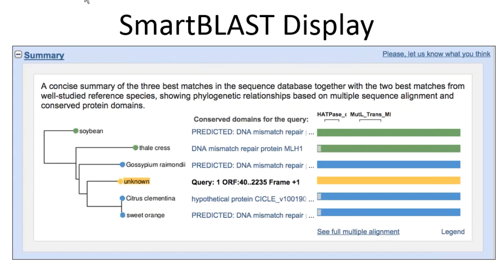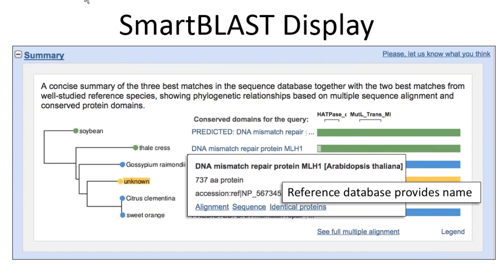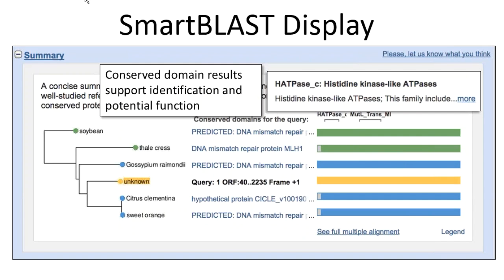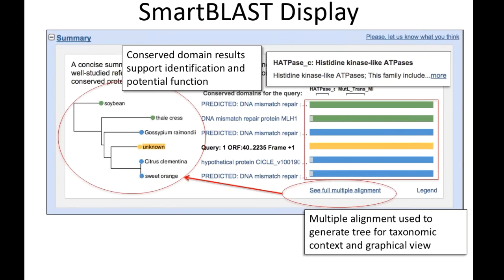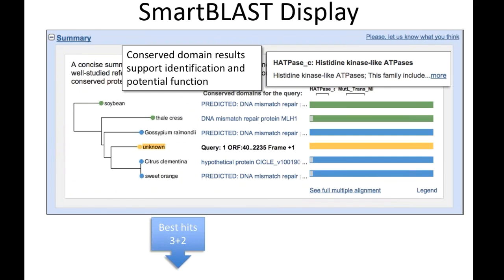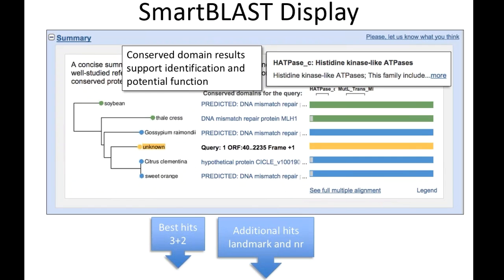We have a bunch of other plants, providing taxonomic context. It gives me the conserved domains — you can see the things I would expect for the MLH1 protein. The graphical overview shows the full-length relationships among those proteins: the name from the reference database, the conserved domain results, and the multiple alignment used to generate these graphical views. We also have the traditional BLAST report below with three hits from NR and two from the landmark database, plus additional saved hits.